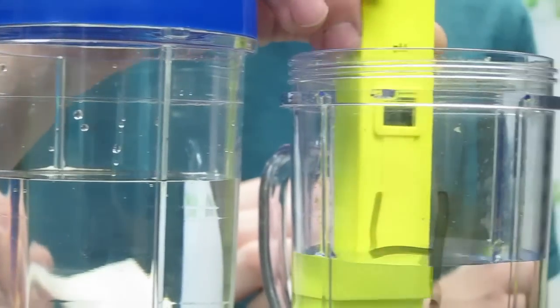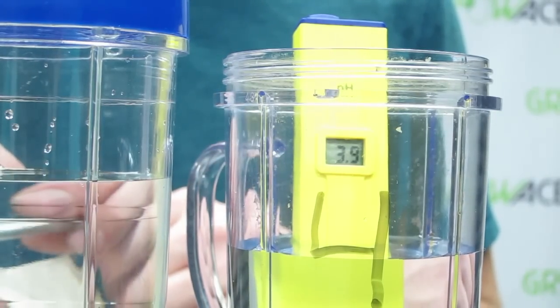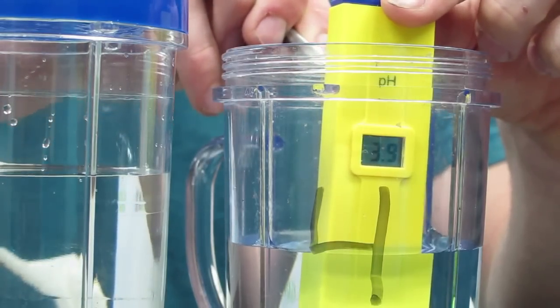Now dip the electrode into the 4.0 pH solution. Wait for the reading to stabilize. If the meter does not read 4.0, repeat the calibration process.